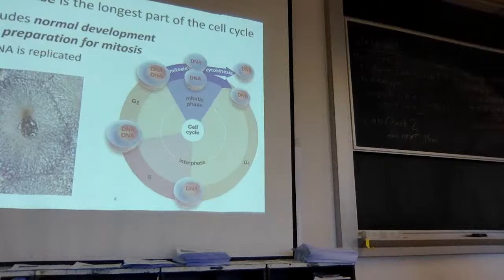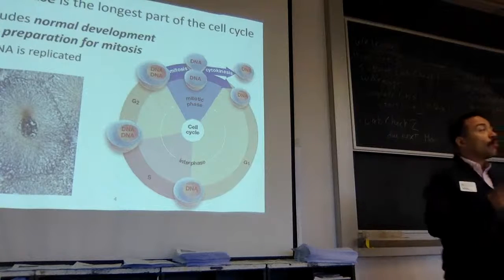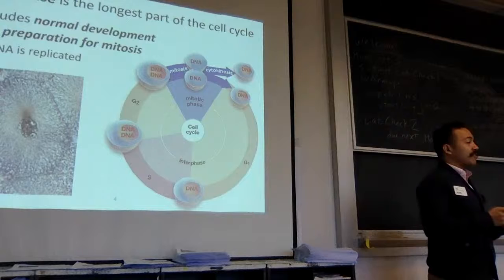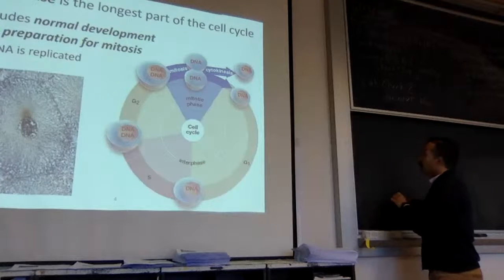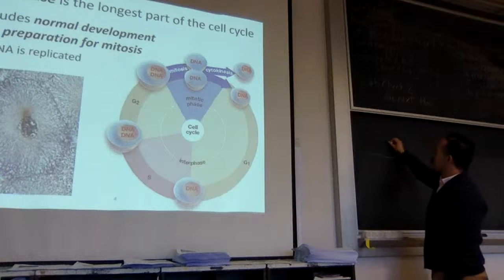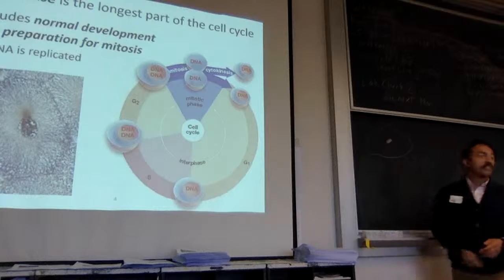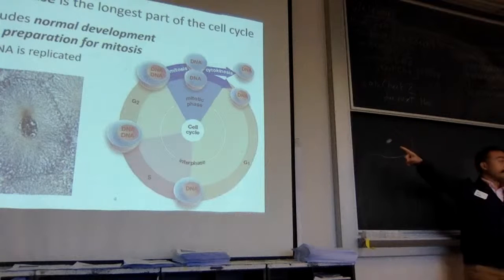We're going to go over these different stages. Because this is anatomy, what I want to focus on is how these cells look, what they appear as under the microscope, and why they appear the way they do. When we look at most of our cells under the microscope, what we saw with the cheek cells, for instance, we saw a blob of a cell with a nucleus in the center, and that's really all we saw. This cell was likely in interphase.